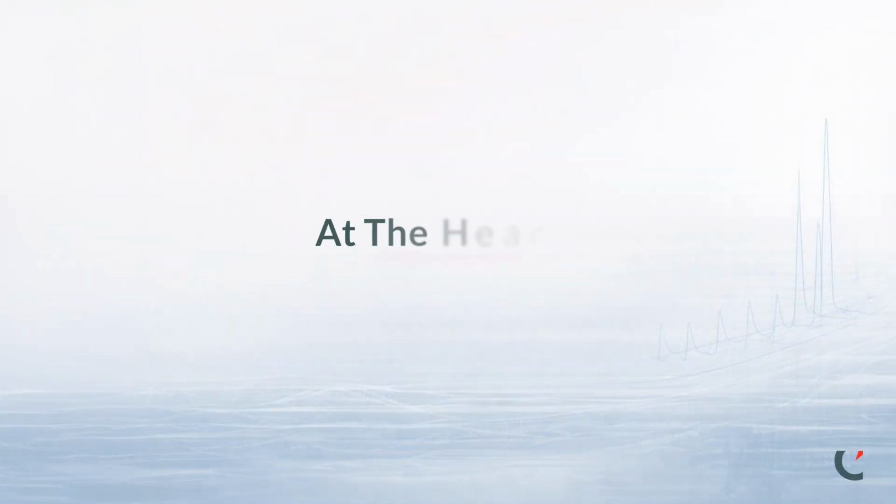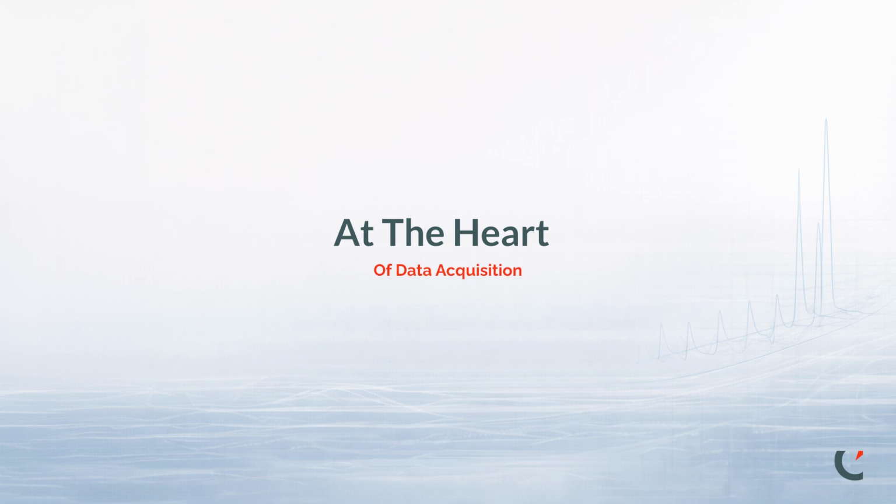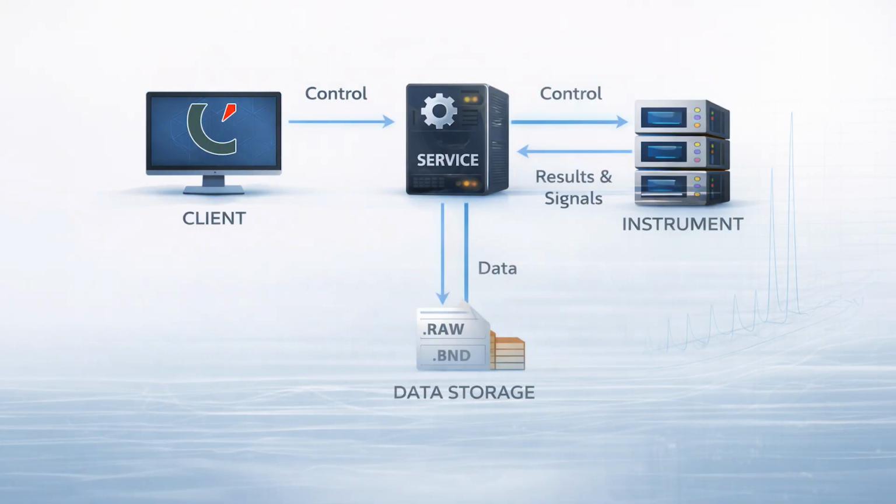At the heart of data acquisition. At its core, Chromperfect data acquisition and instrument communication is divided into two primary components: the Chromperfect Service, or CP-AC service, and the Client, or CP-AC client. Understanding this separation is critical before collecting data.